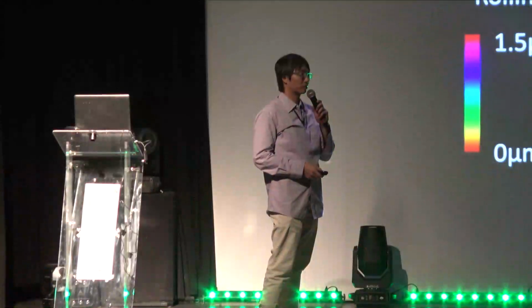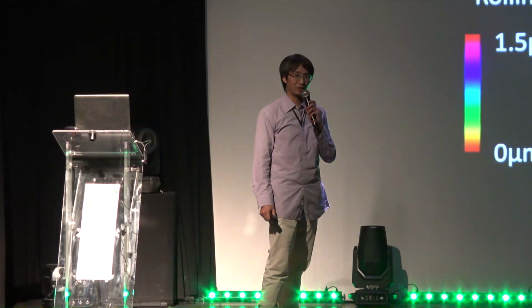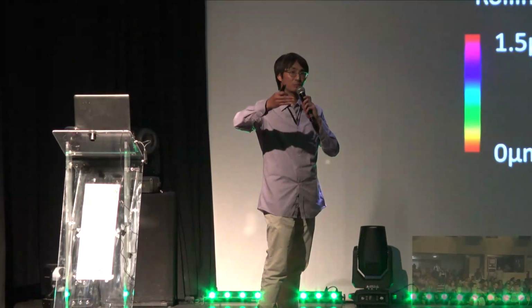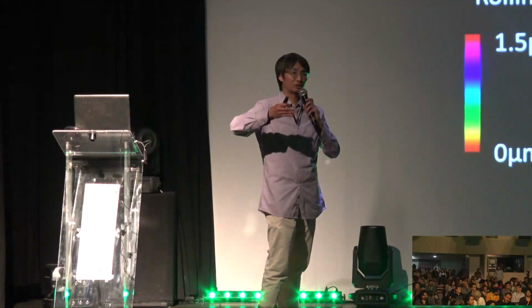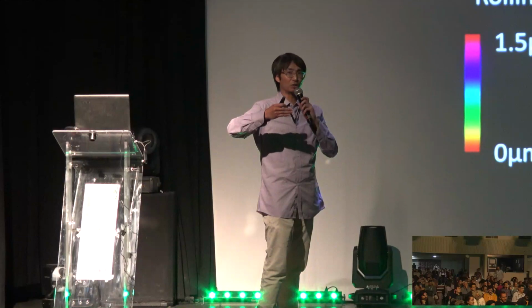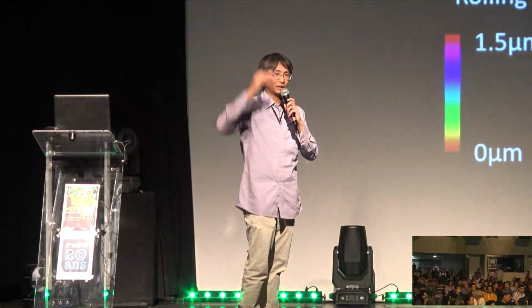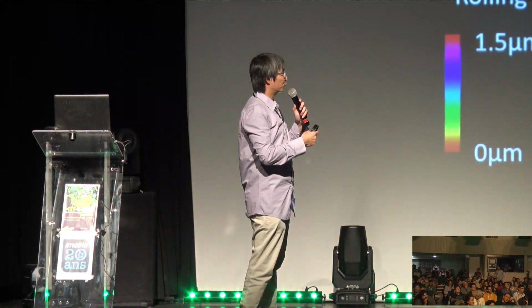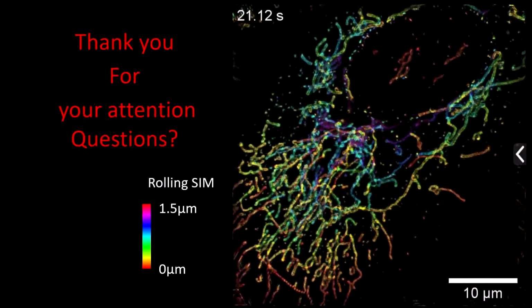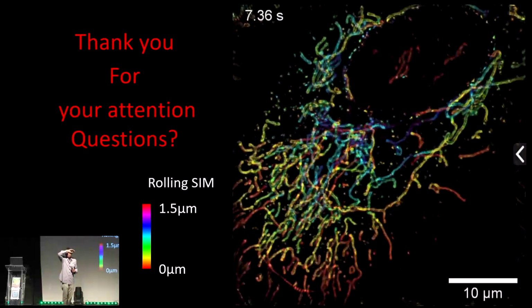So basically, you can play around with the angle. What we usually end up with is we want to collect as much angle as possible, because you don't want to lose the resolution, and you also don't want to have the light sheet coming in at a very steep angle. So I think with our system, most of the time we use 45 degrees of the light sheet angle. But you actually would want to go to 50 degrees or 55 even.